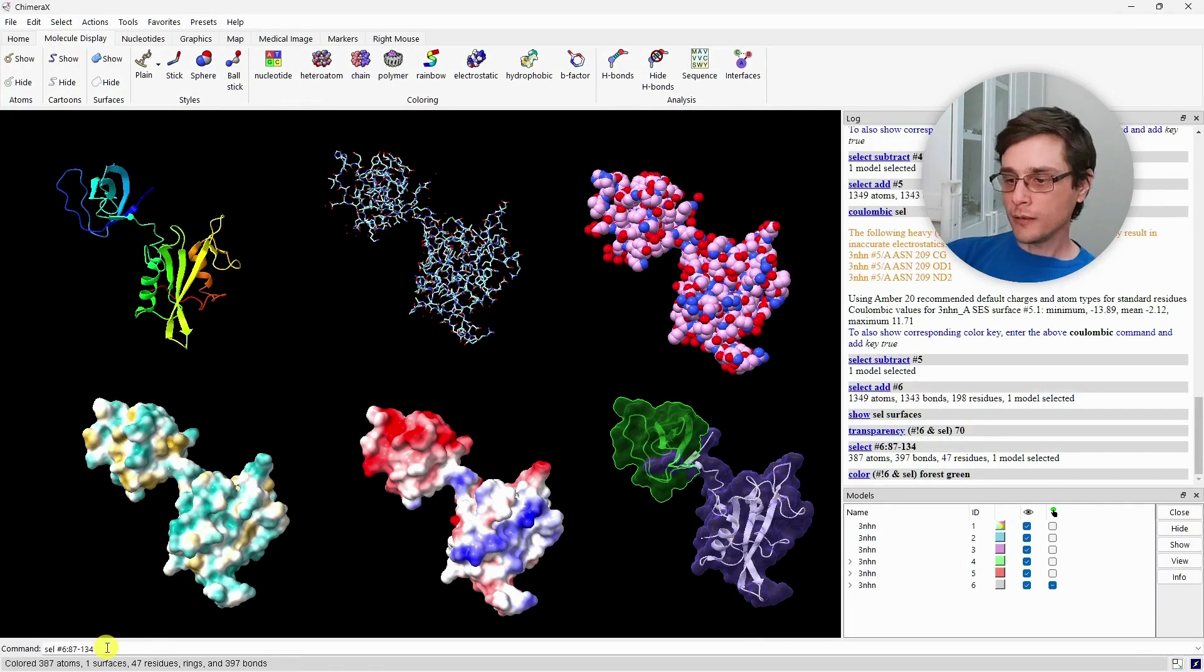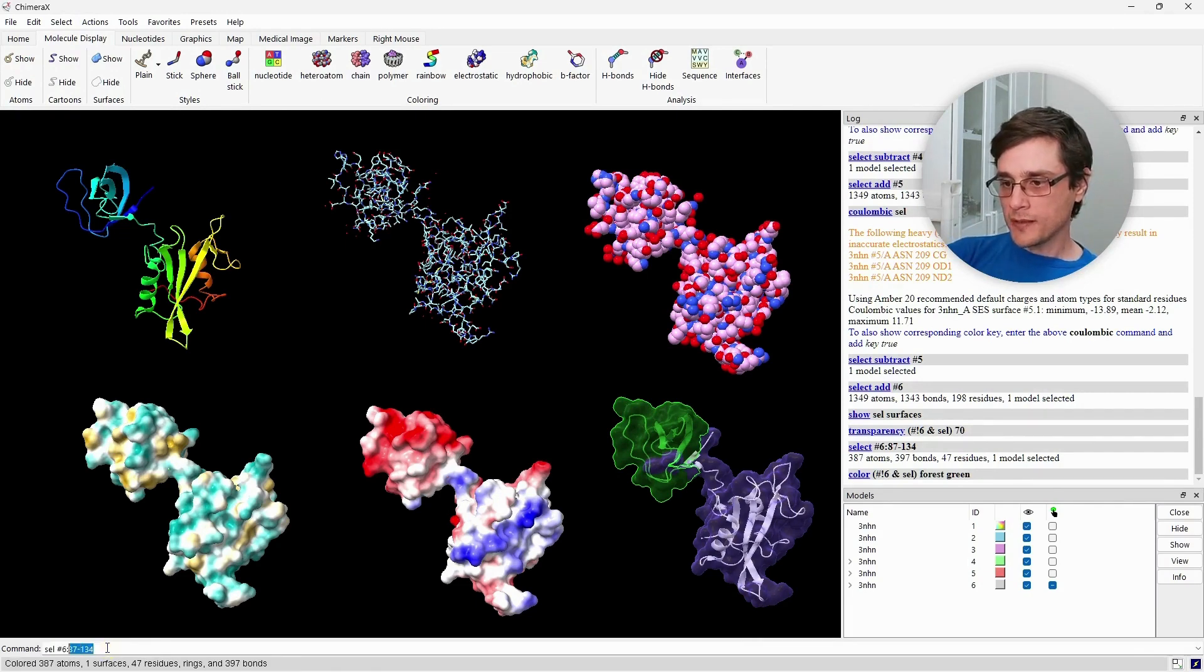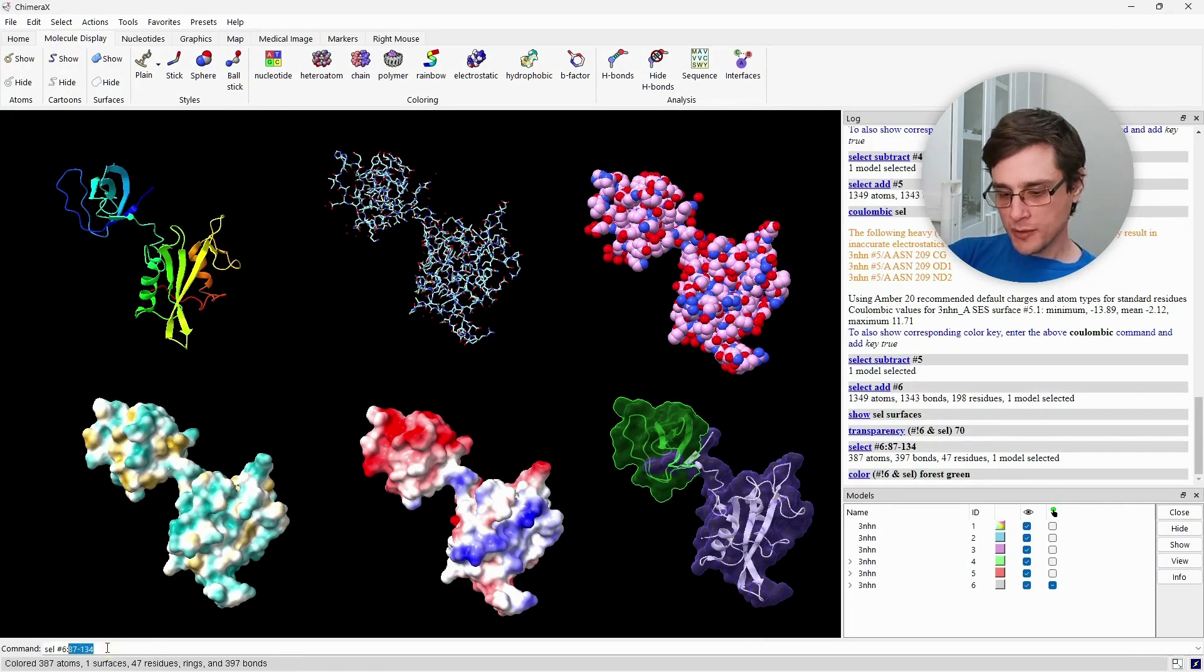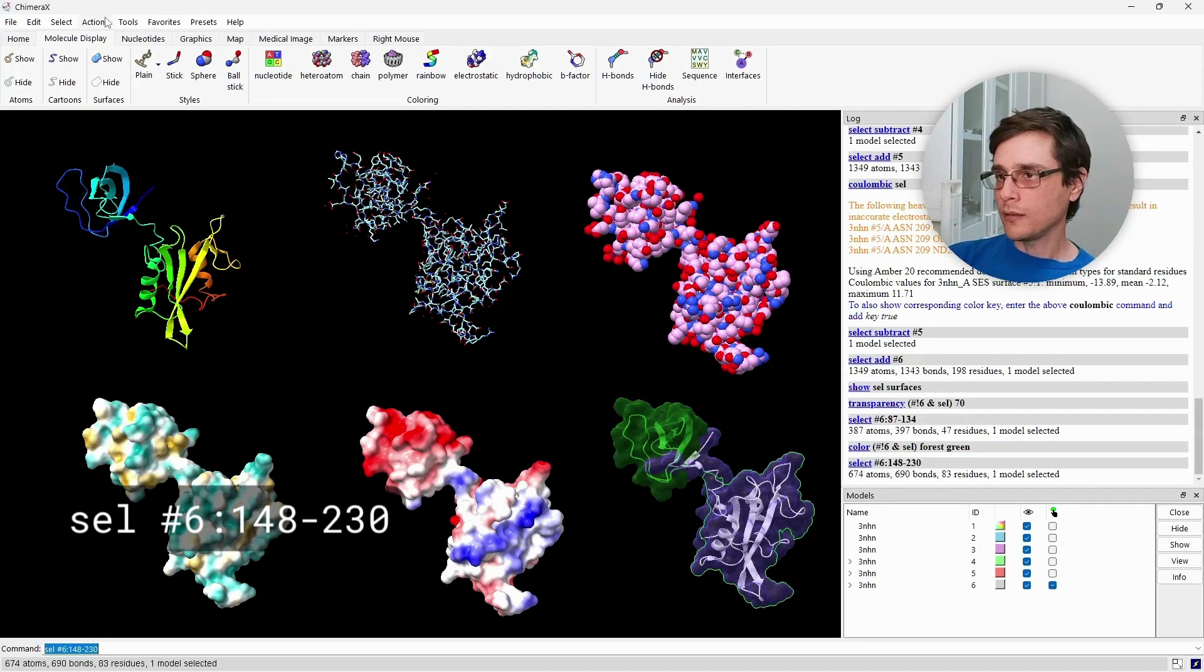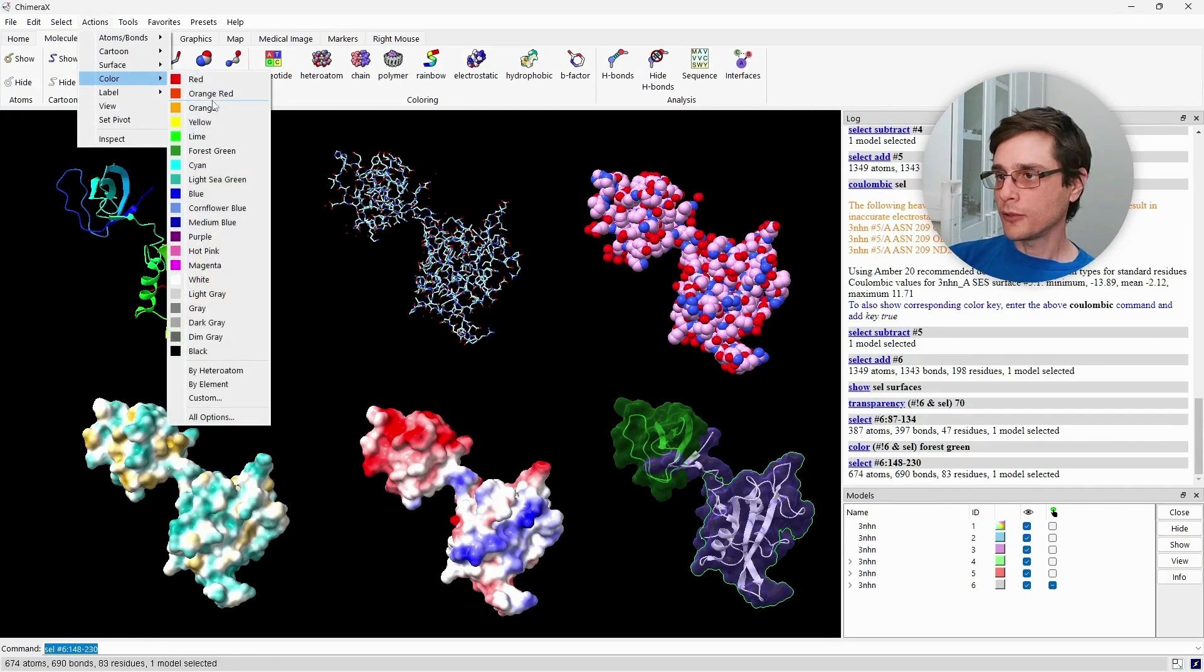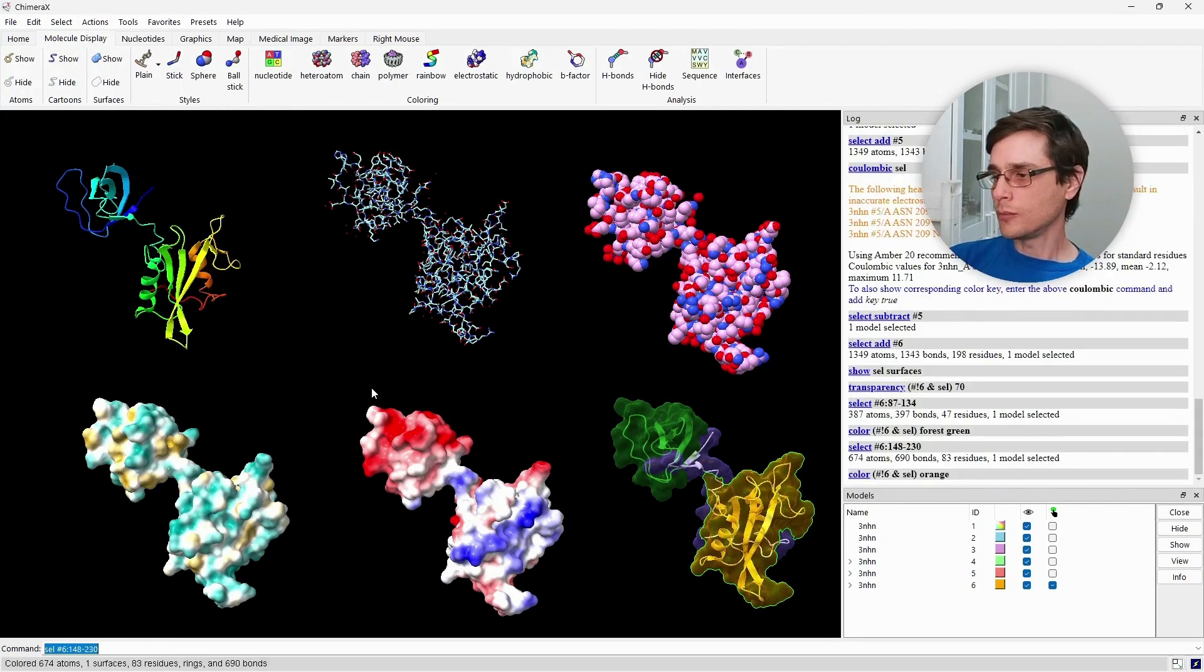Again, we will do this for the SH2 domain, which spans residues 148 to 230, and color it with a different color. Like so.